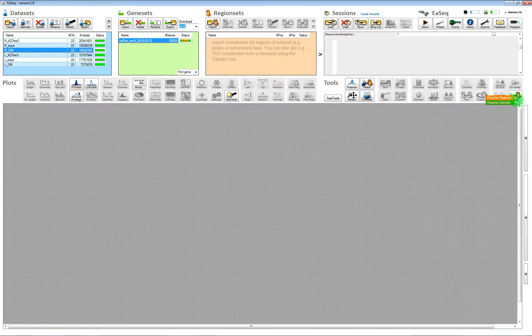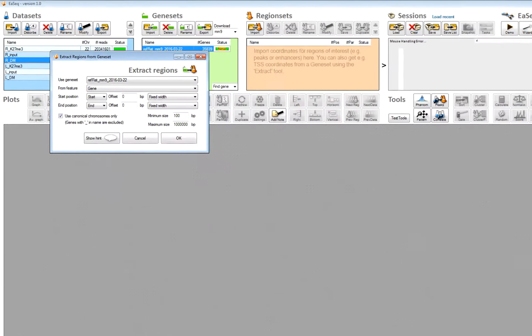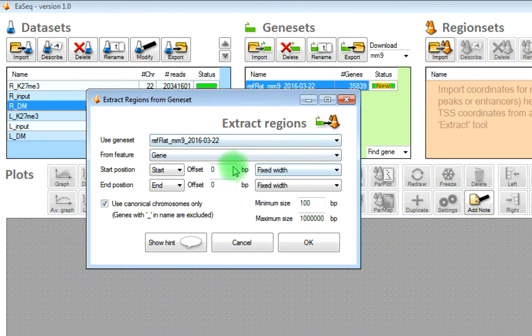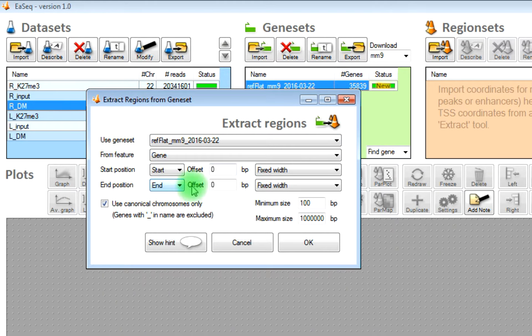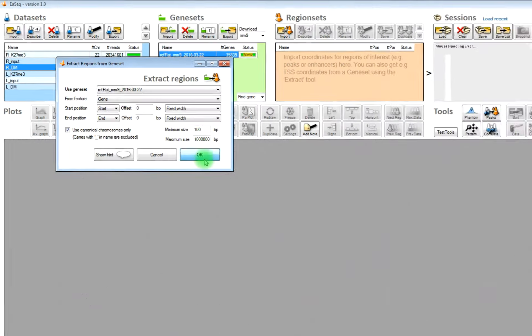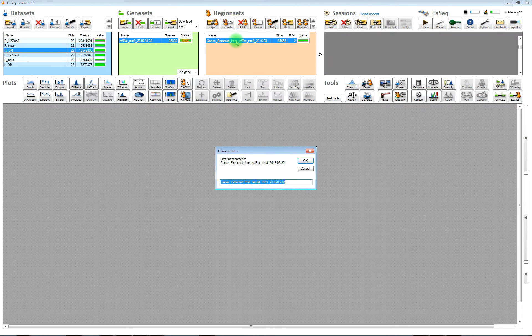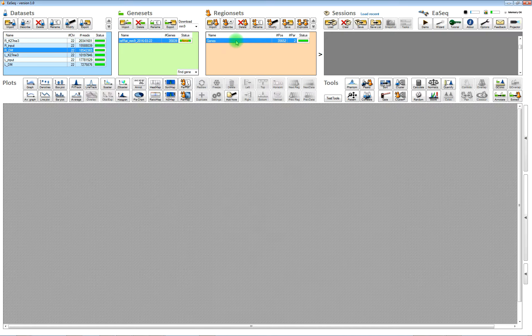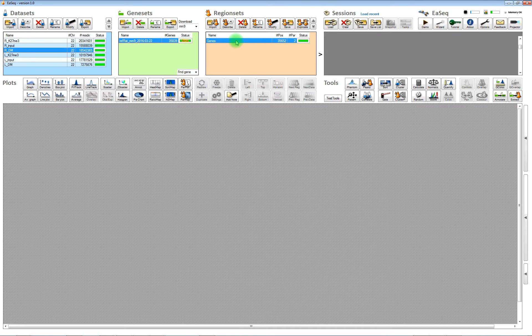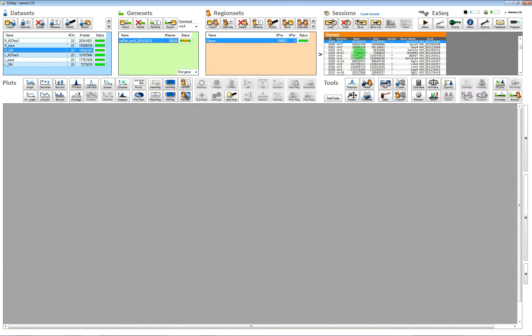Once it's imported, then you can extract some regions from these genes, some regions that correspond to the gene bodies. Just use the default settings and after they are extracted, then you can rename it to a shorter name. Here we'll call it genes.